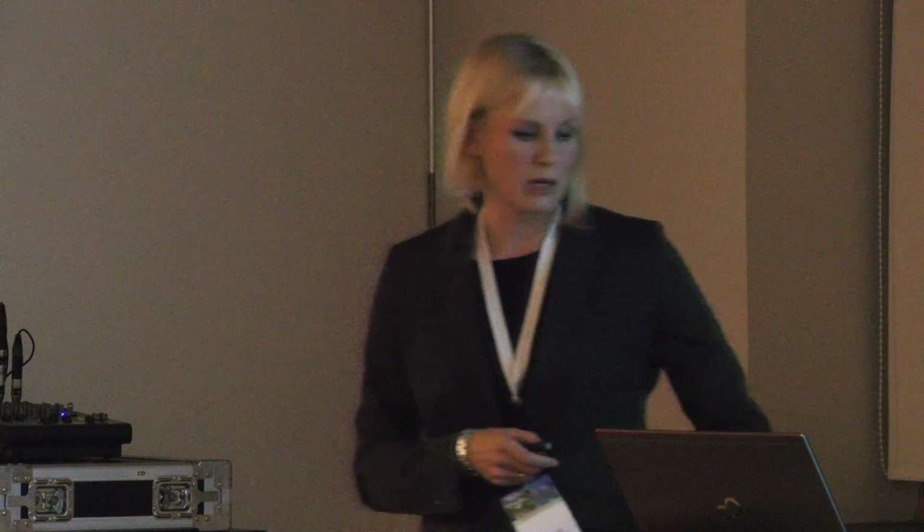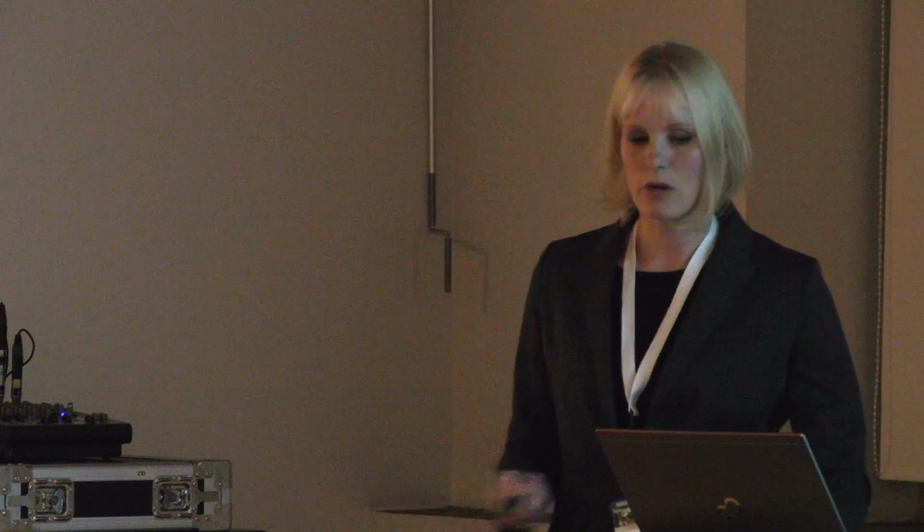Then one option is continuous centrifugation. If I say that centrifugation is not scalable, then some of you will say, well, there are scalable systems, and continuous centrifugation can be a scalable option. So yeah, it is. Centrifugation is typically said to be not scalable. Sometimes you need to collect by a needle, which I don't like. I also think that's a safety aspect. And sometimes centrifugation is just time-consuming and requires handling.